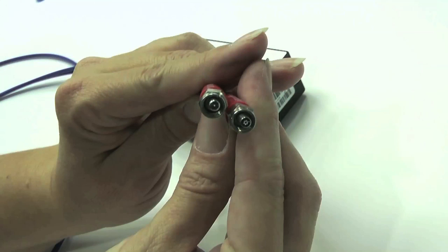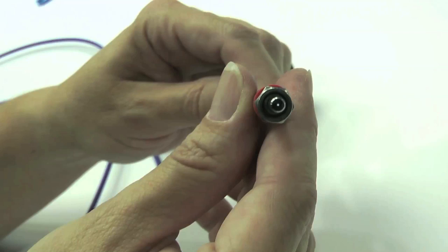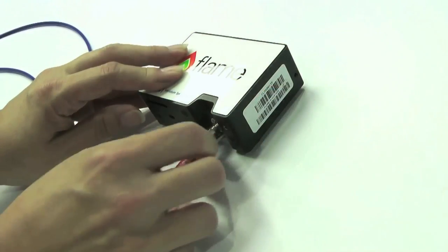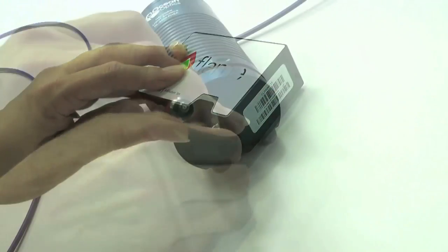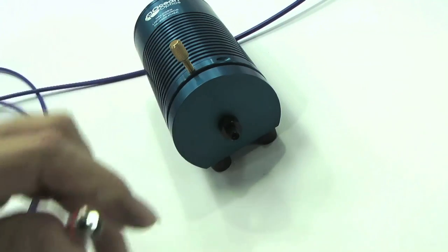The reflectance probe has two fiber ends with SMA connectors. One consisting of a single fiber and the other with six fibers arranged as a circle. For optimal performance connect the single fiber to your spectrometer and the other to your light source.